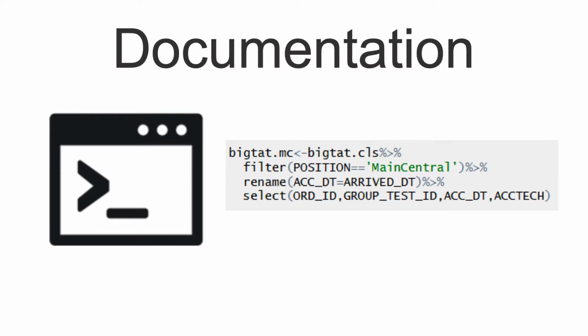Now, I would admit that this is less legible than perhaps my scribbles on a notepad, but the truth is that nothing can happen to this data that I haven't written here. So I know precisely what happened. And even maybe some of the more adventurous people here might see that there's some filtering going on here and some renaming going on. So the scripting languages do have that asset in that they're not completely a black box in terms of how it works.